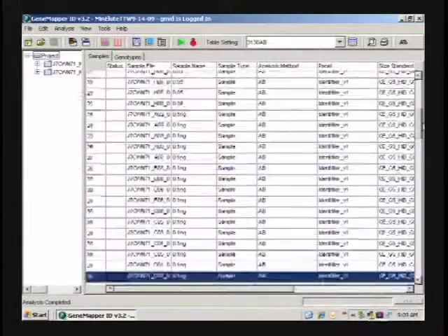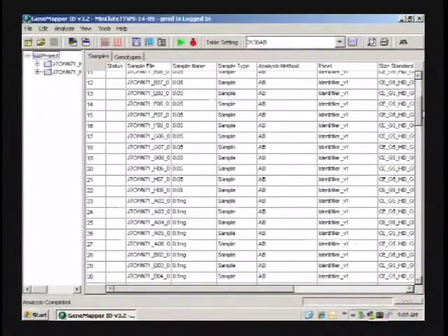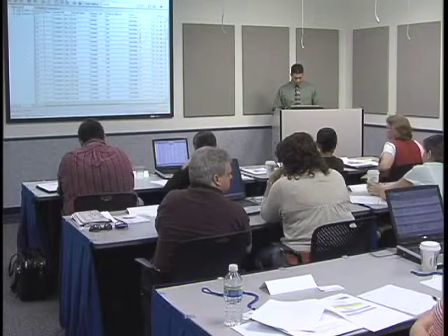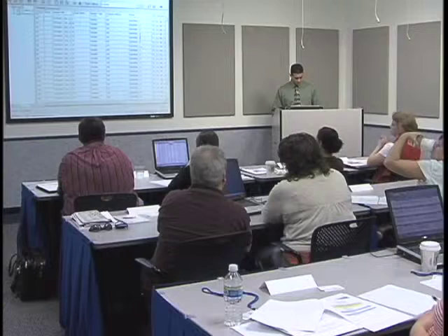Is there anything else? What about a 0.05 nanogram sample? Who had one of the later number samples? 1 microliter? Either one, just to see the 0.05. I'm looking to see if I can get some dropout. I was number 51, and that was at 1 microliter. Yeah, that should have been a 1 microliter.